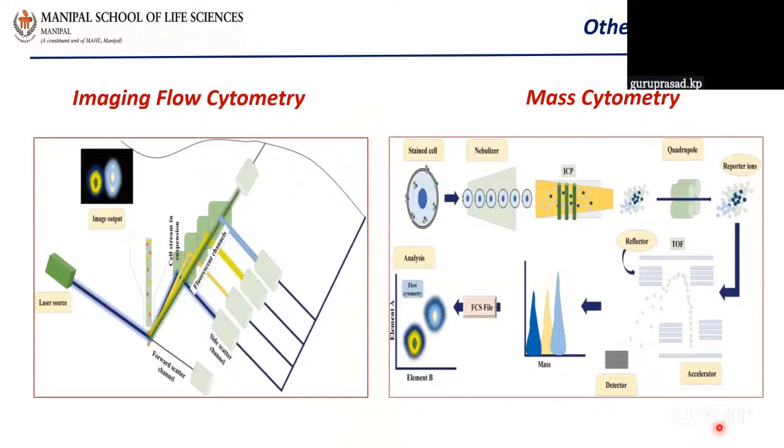And nowadays we have flow cytometers called image flow cytometers. Not only are you running the cells and analyzing using plots, but you can take an image of each and every cell. So you can look at the image of the cells on one hand, like a microscope, and on the other hand you can see the sorting. This is the advancement that we are finding now.